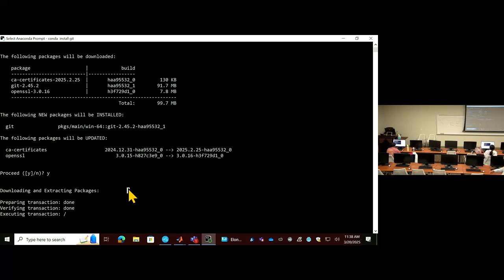So those are the very typical operations in using Python. You install a Python package this way. Say yes, just click. It's good. Still running, it takes some time, a large package. Okay, so it installed a lot of dependencies.